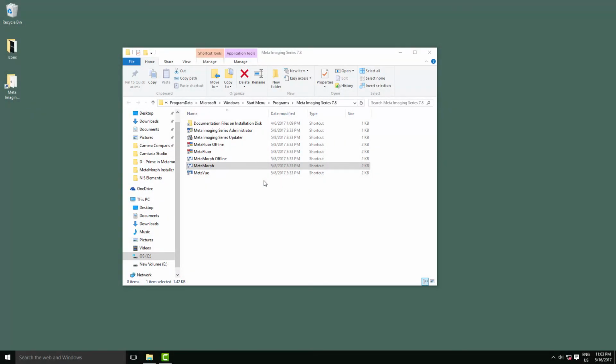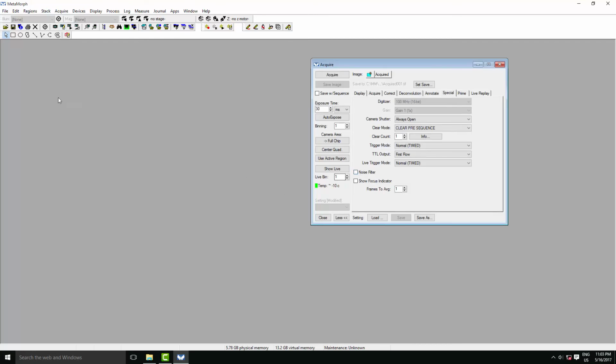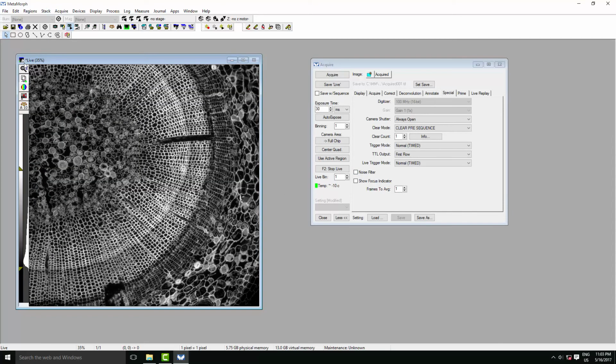In this video, we're going to look at using a Prime sCMOS camera inside MetaMorph. So first of all, we're going to load up MetaMorph, and then I'll talk about some of the features of this camera. Just have to quickly deactivate this noise filter, which is on by default. And here we have our picture.